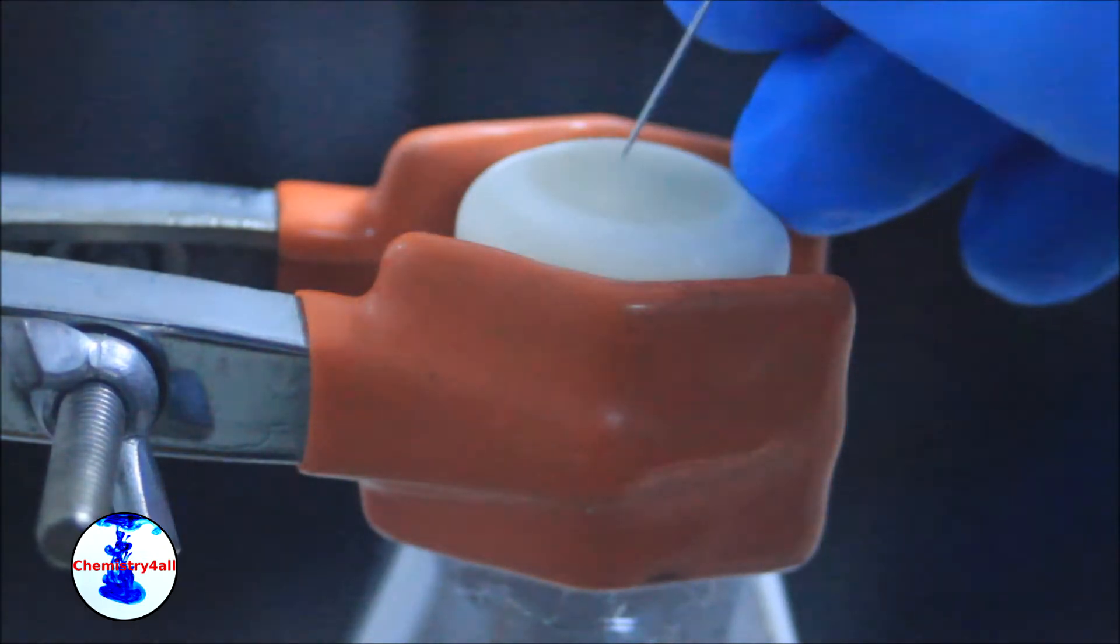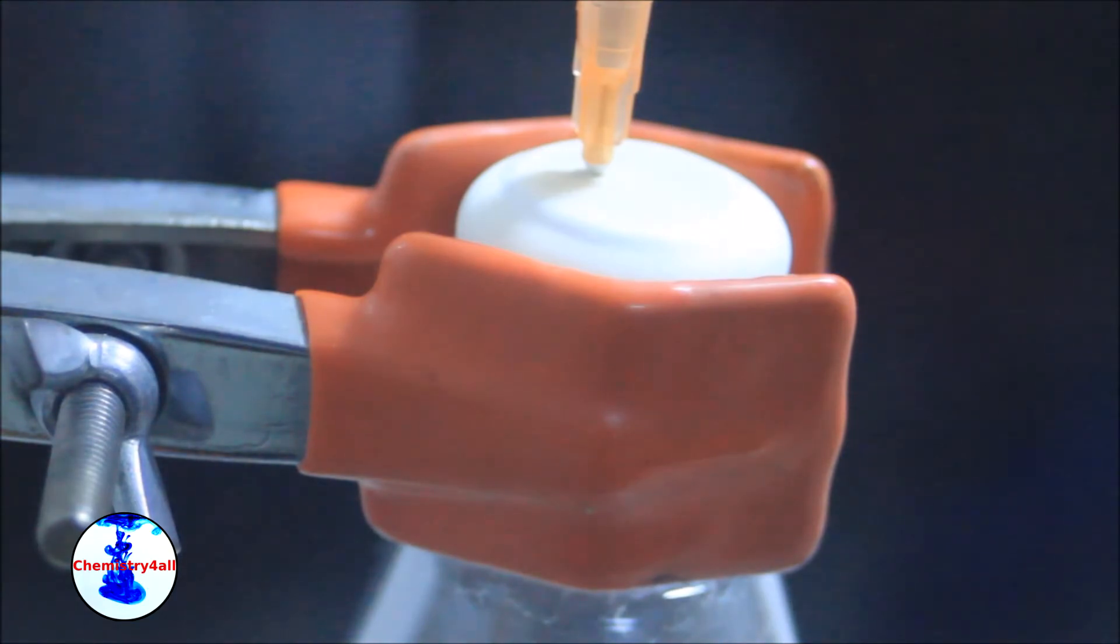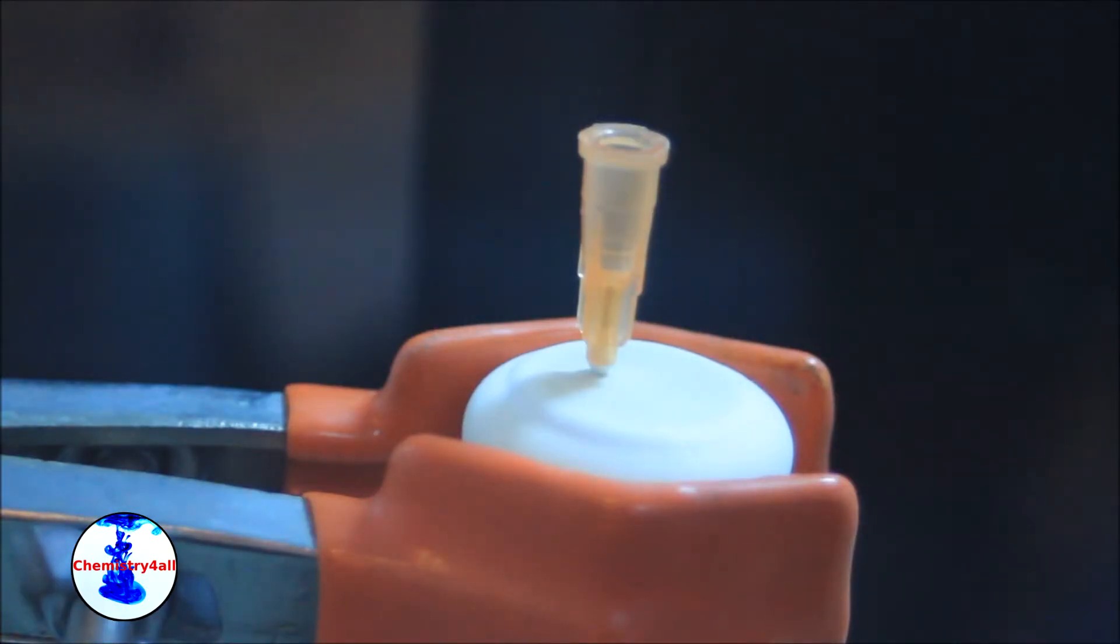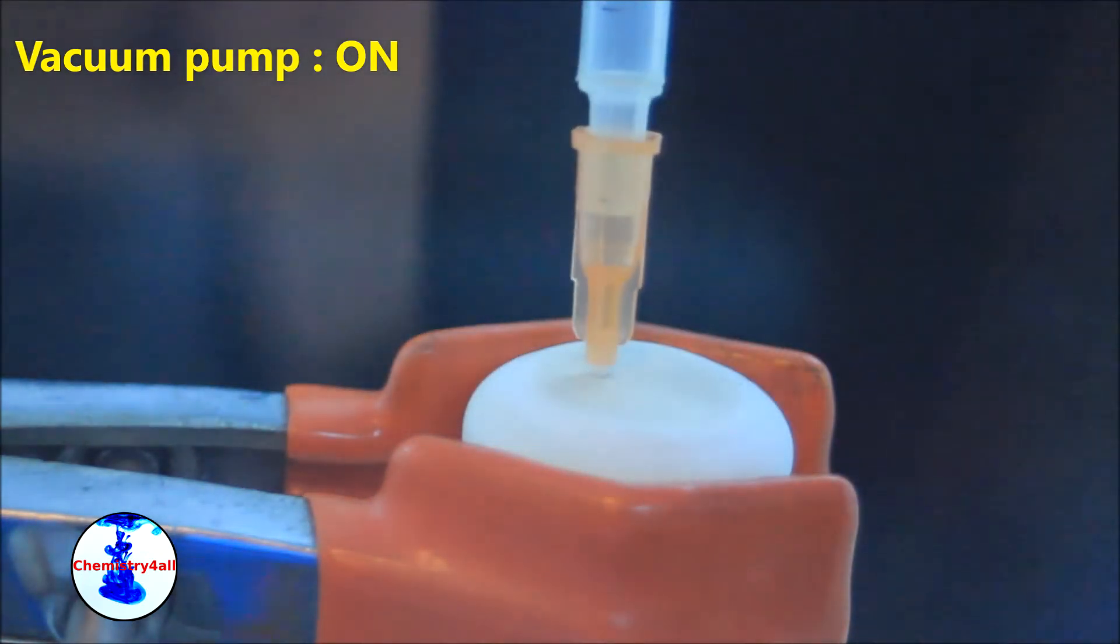Now we can seal the flask with a rubber septum, then connect a needle through the septum to the vacuum pump. This will remove most of the air present in the flask and most of the moisture within it.